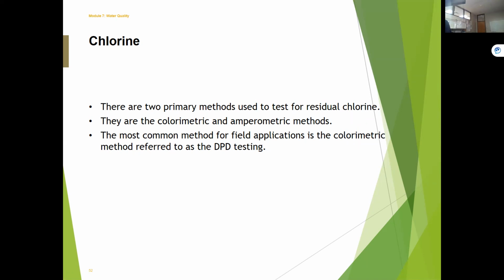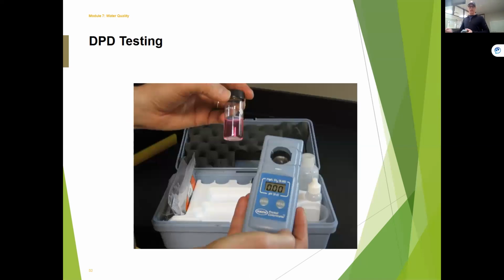Fast forward a few years, this is pretty typical, like the picture here. This is my old kit. Man, I've had this thing for like a million years. That's your typical DPD. I still have this kit, it's been with me for a long time. I don't think that's used anymore. But basically, this is a light source with a filter.